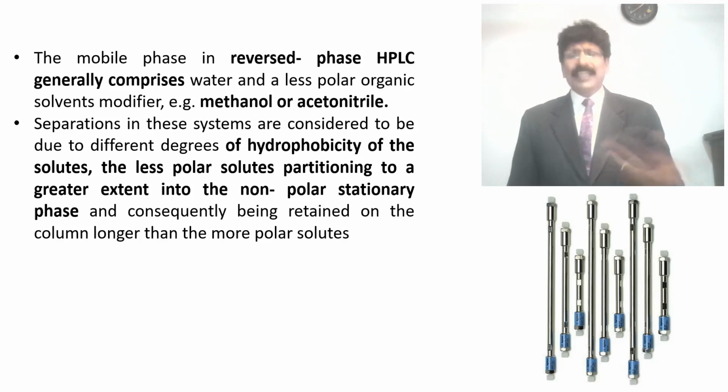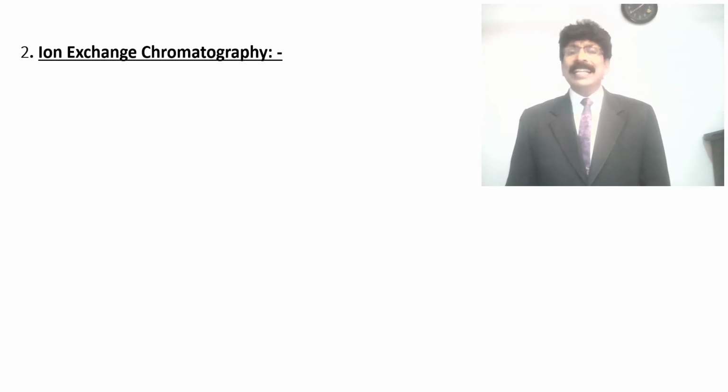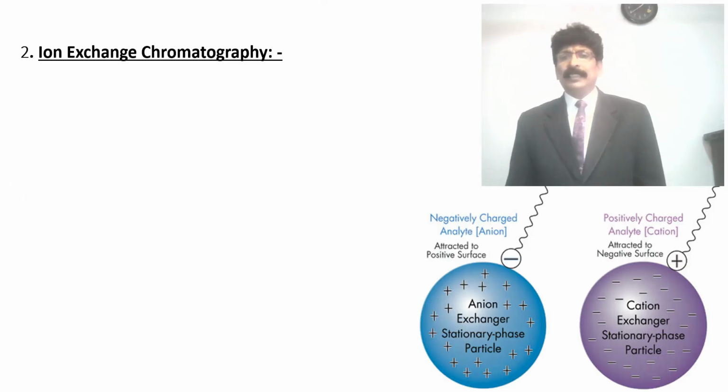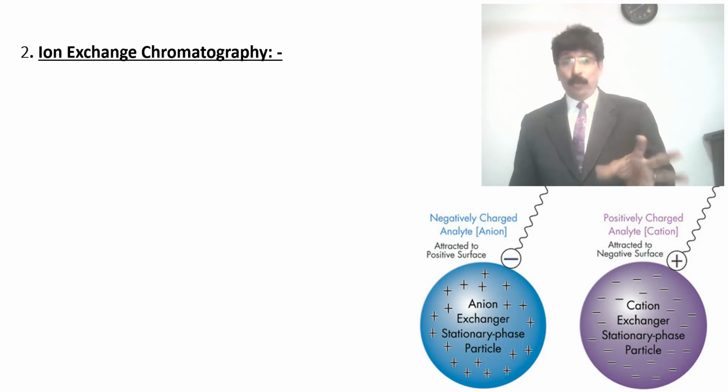Next, ion exchange chromatography. See the picture. Ions, anion, cation, anode, cathode, you know that.